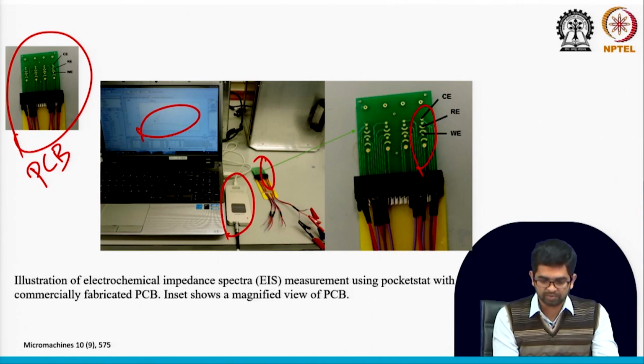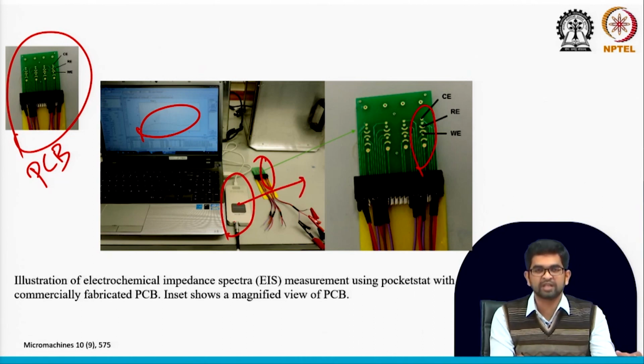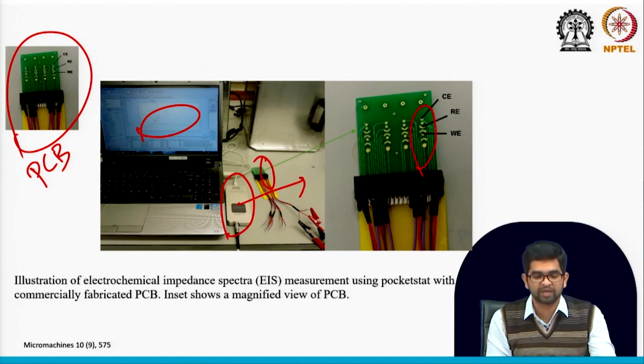See, this is a very portable potentiostat we are using. That's why this kind of technique can also be useful for point of care, for field testing. We can see the monitoring. We don't need much washing step. You can just add the target concentration, and you can see the change on your sensor surface easily.